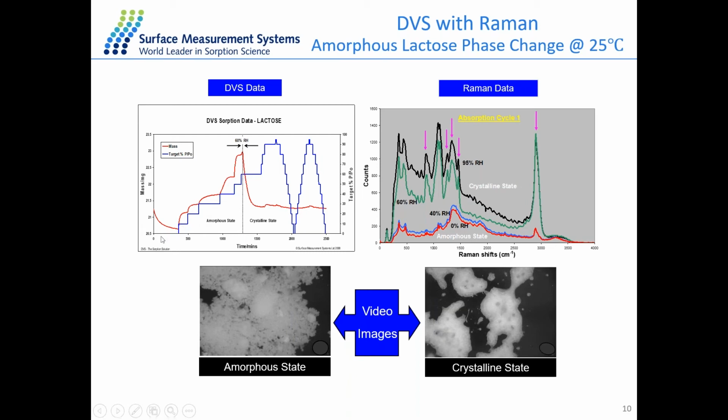We're increasing the humidity from 0% RH to 90% RH with 10% intervals. The right line is for change of mass for the sample. So you can see at each percentage RH, the sample is picking up the moisture, reaching a perfect equilibrium, and then jumps to the next stage automatically.